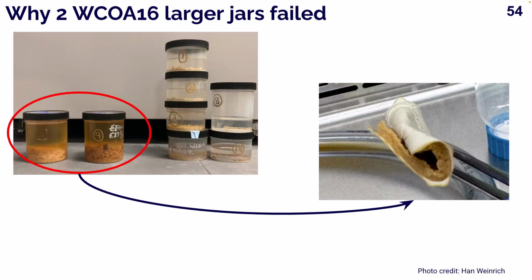So we're seeing that we do get a correlation between megalopae and DNA concentration release. So that looks really good for us for when we begin to start applying this to our eDNA water effluent samples.